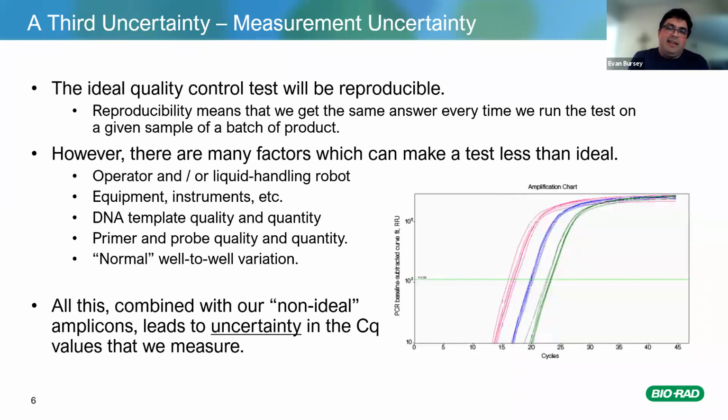And that seems like a given, right? Well, of course you do. And it might seem like all you really have to do is run a few qPCR reactions, measure the CQ values, the CT, CQ, it's all the same thing. Measure those values, and you see what you get and determine whether your product's working.